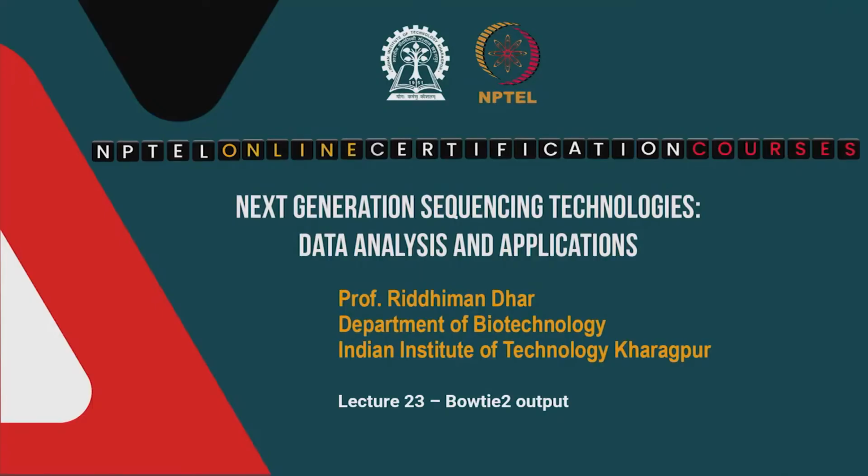Good day everyone, welcome to the course on next generation sequencing technologies, data analysis and applications. In the last few classes we have discussed the mapping algorithms and then we have followed that up with some hands on. So, we have introduced a tool called Bowtie2 which actually does mapping, and we installed this tool in our system, and I have showed you how we can build genome index, right.